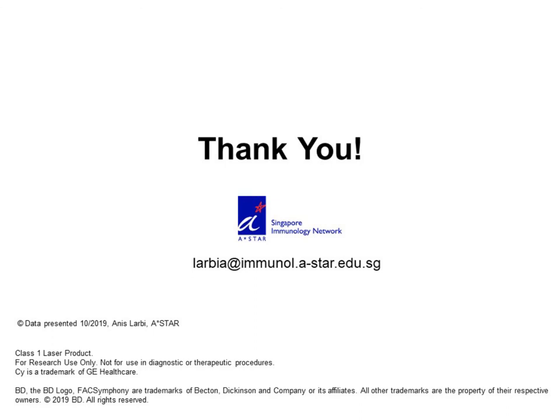I think the best that can be done is still the fluorescence minus one, the FMO, which consists of running your whole panel except the marker for which you have a doubt. We are running here in our platform a clinical study for a pharma where they request to run the FMO for each of the markers for each of the patients. So you see it can get very intense in terms of workload, but this is one way, and I think it's the best way to ensure that your signal is a real positive.